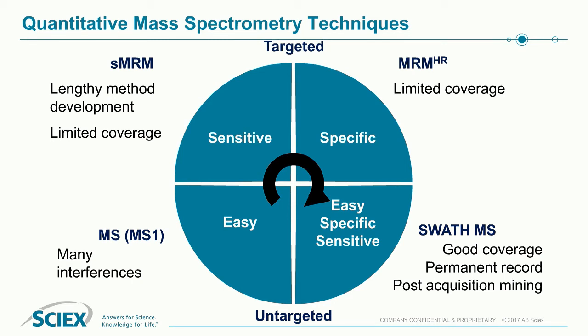It also has a side benefit which allows a permanent record to be left for the sample. So if you do desire, you can go back and actually reinterrogate the sample over many years to see if new proteins were present or proteins were present that have come up as you move forward through your process development.